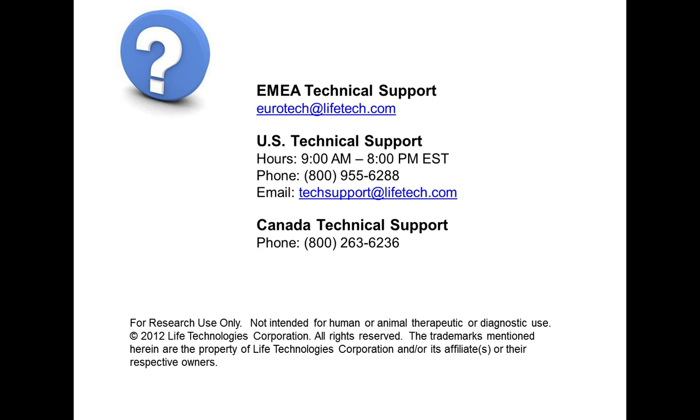There's two classes of dyes that can be used for this, the cell impermeant nucleic acid dyes, such as the Sytox dyes or propidium iodide. And there's also the live/dead fixable stains, which can be used for intracellular staining. These are really reliable methods, and you can gate on your live cells for further analysis.